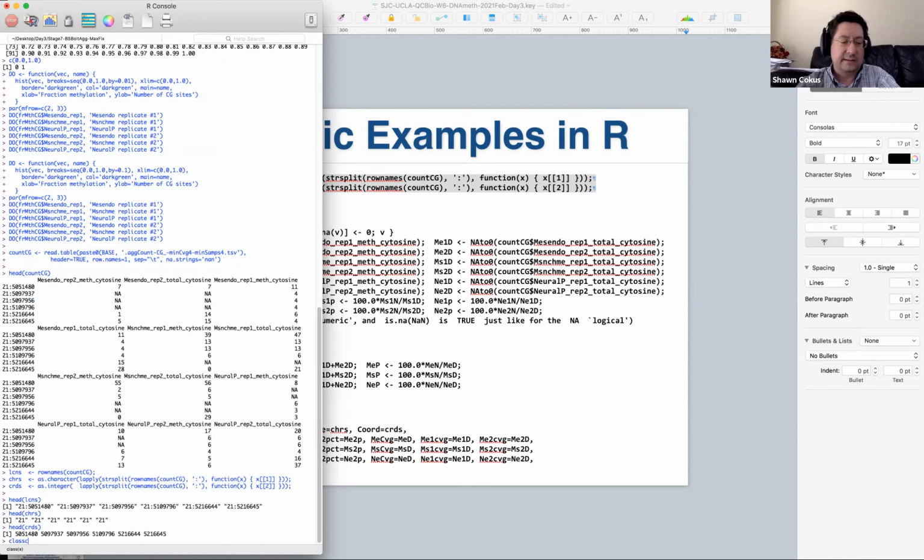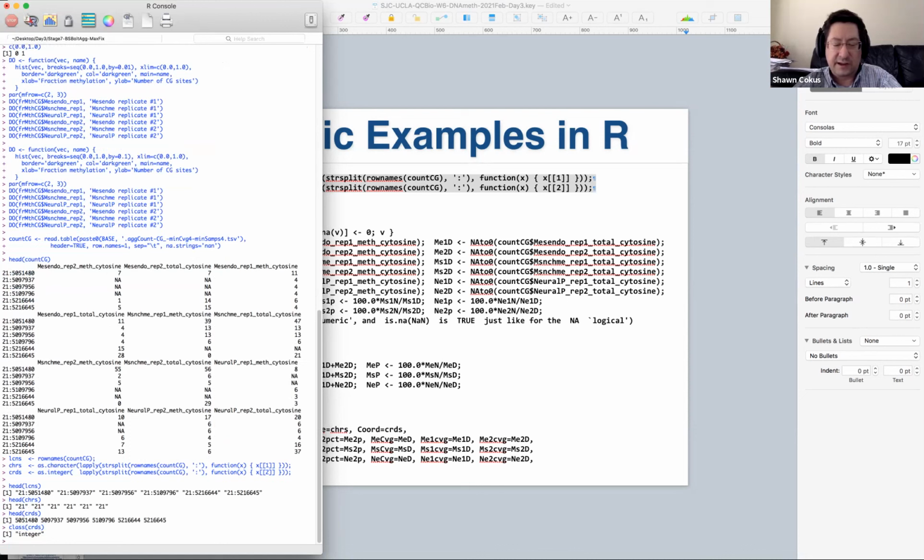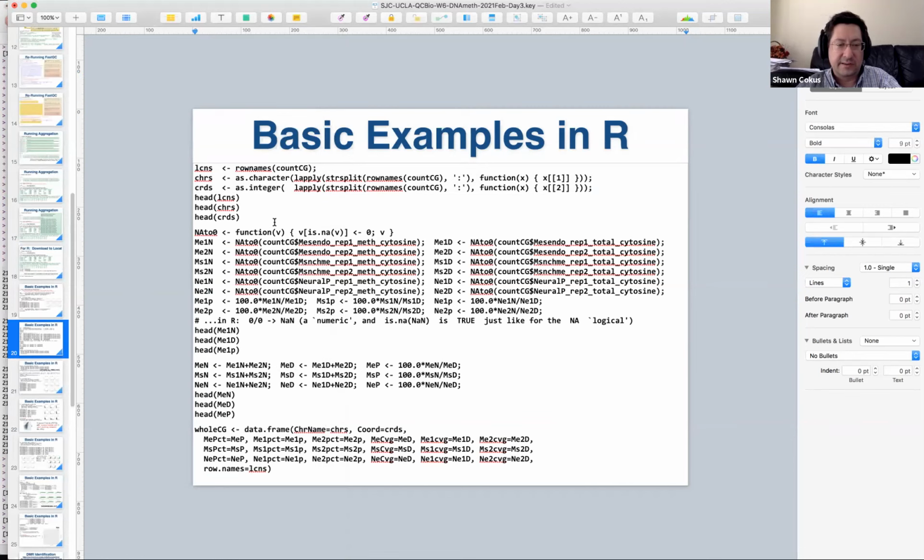That is useful for how we're going to work with them. So that's an integer vector, basically. That looks good, that's been rewritten. That's useful. Okay, that started us on this path. That's kind of like the row labels.